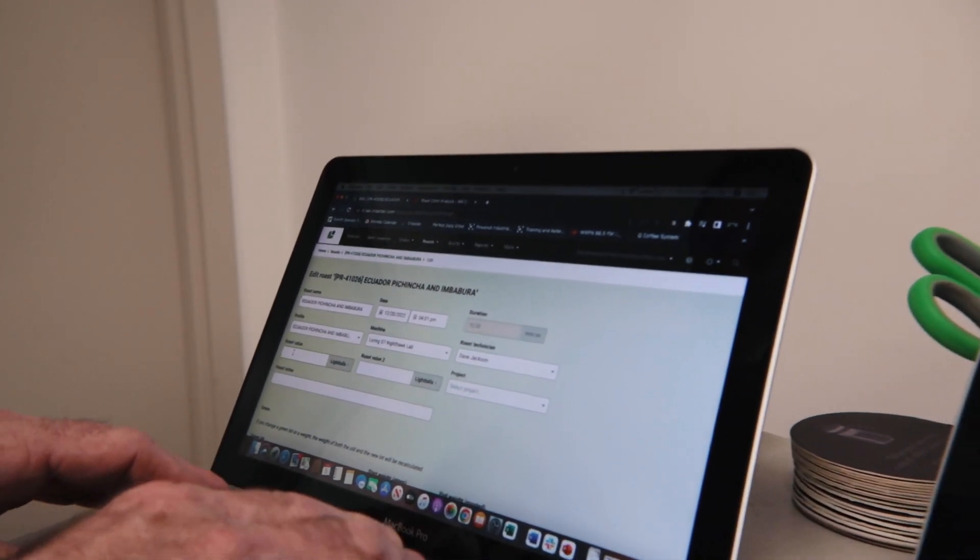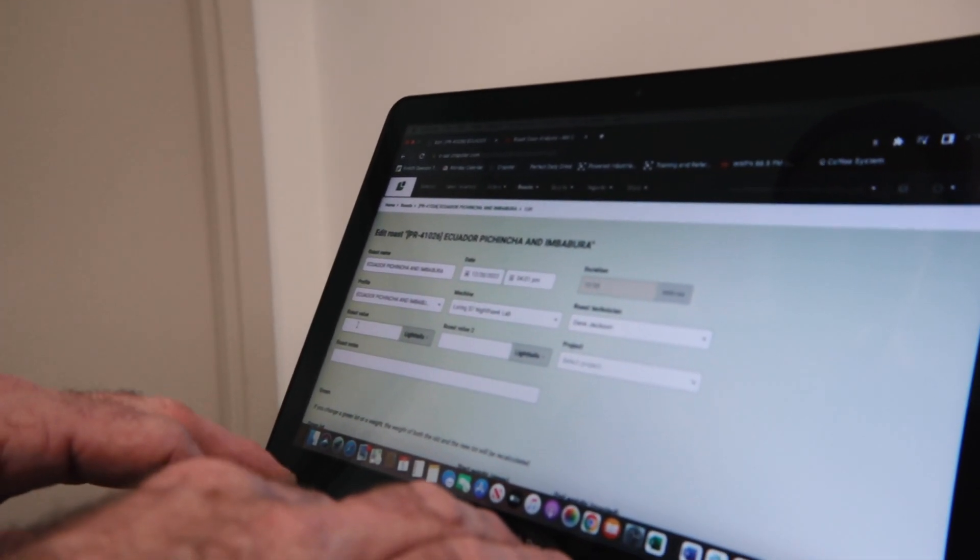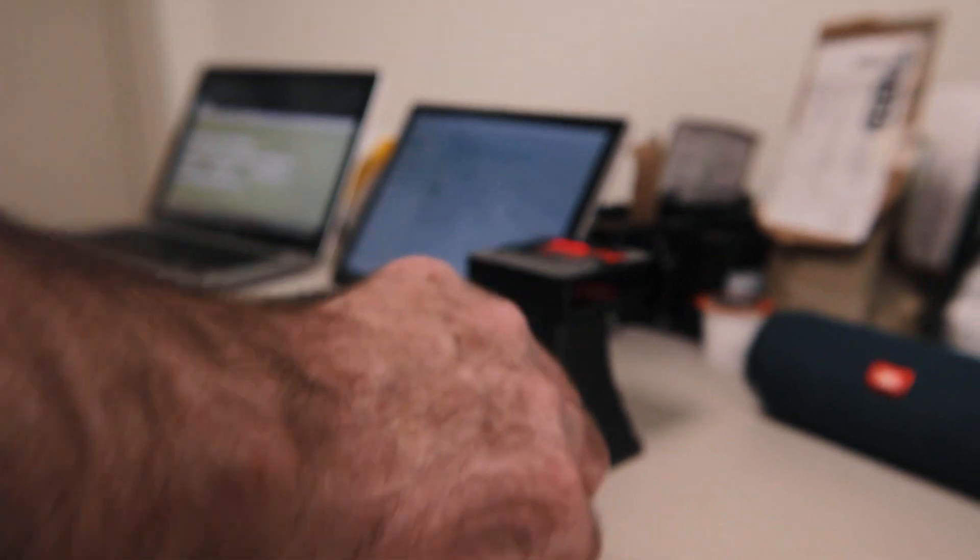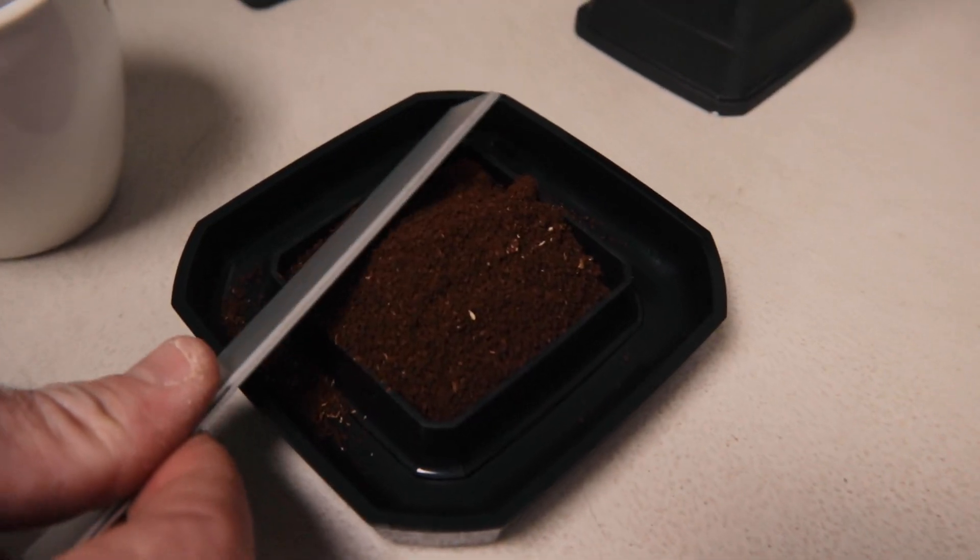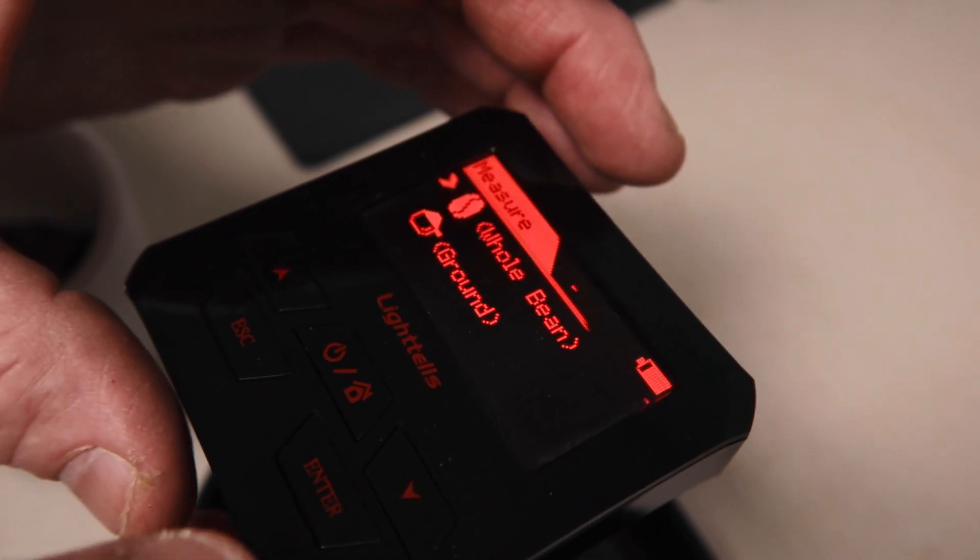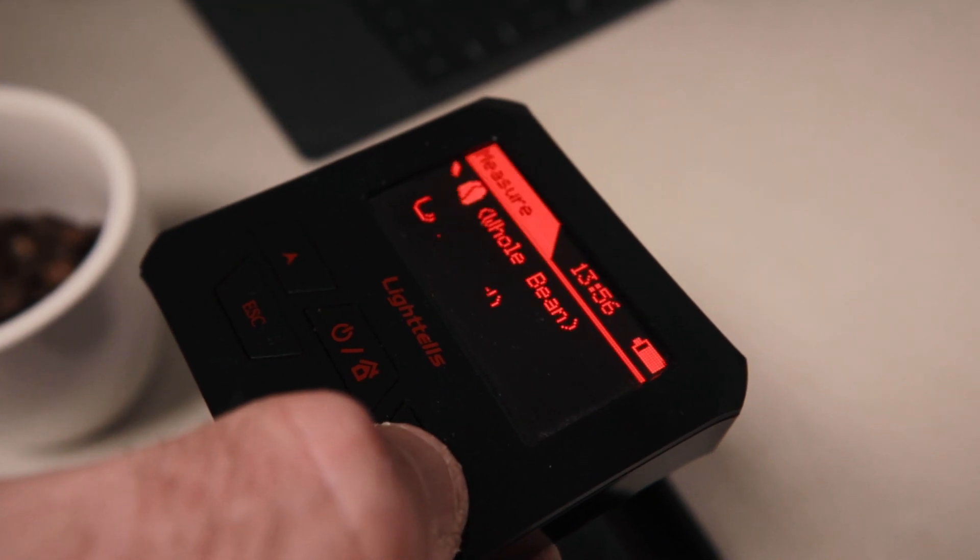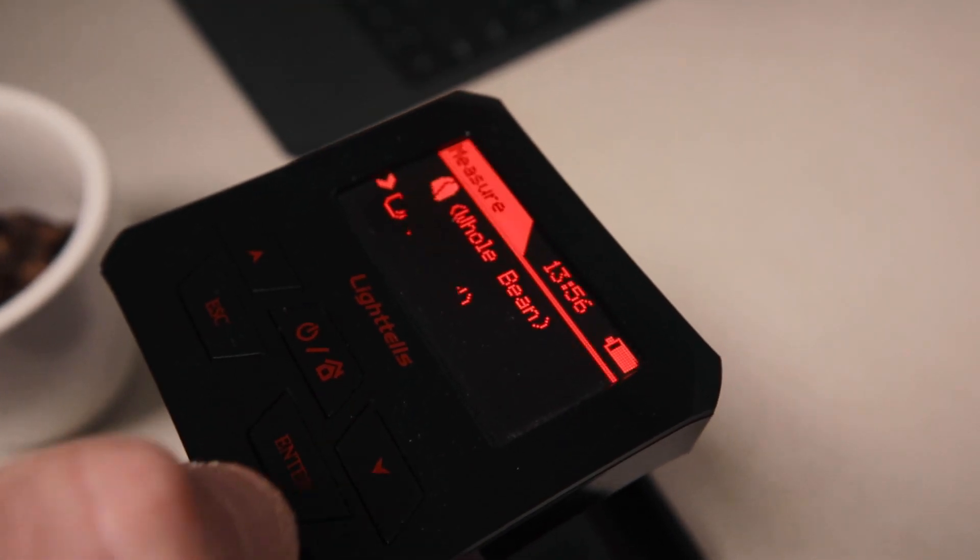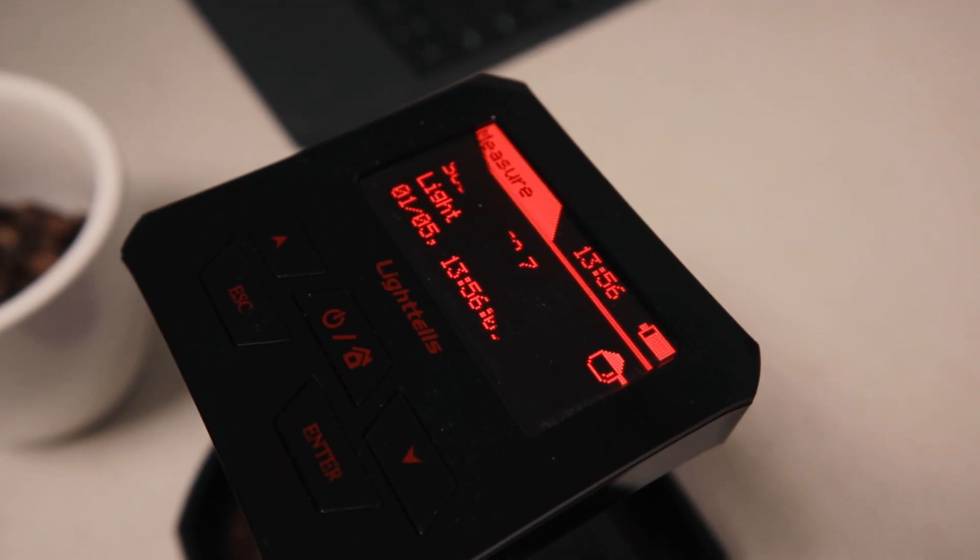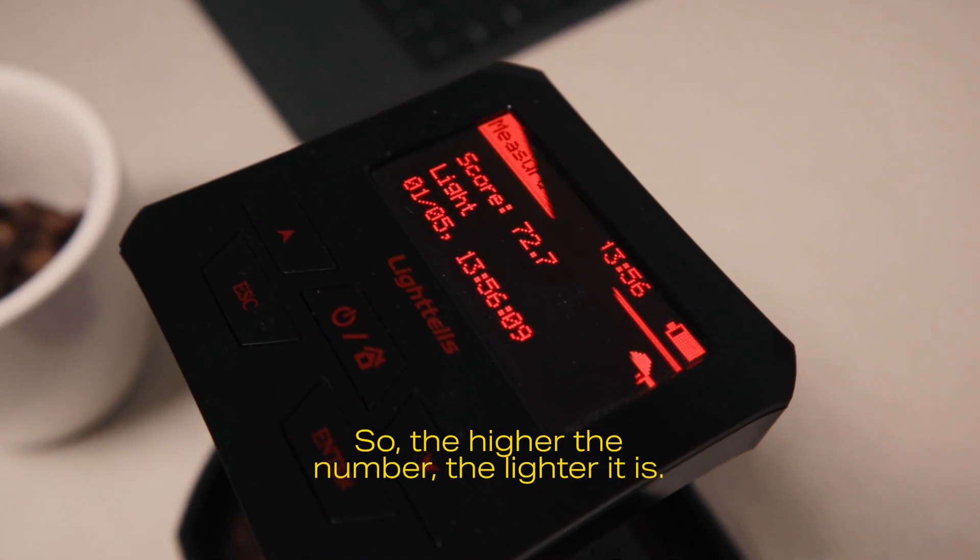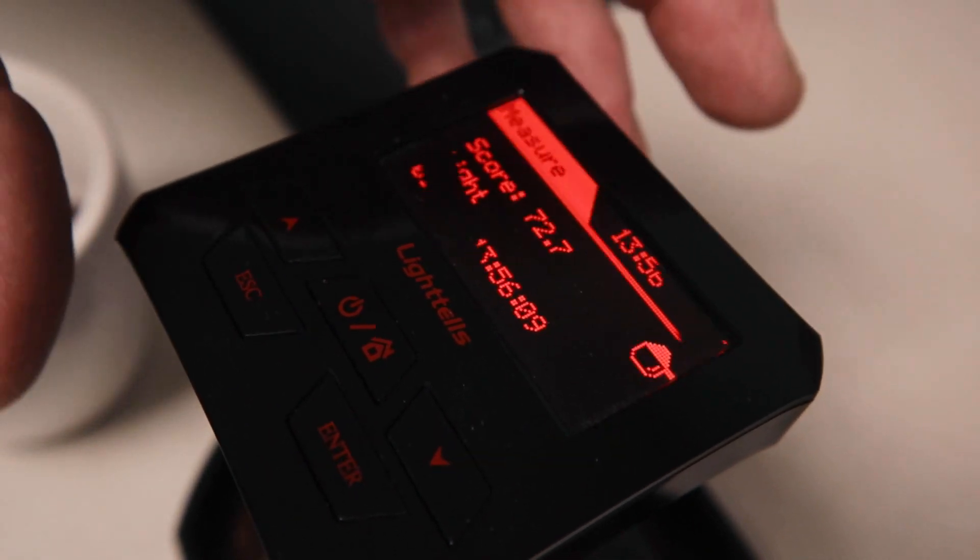I'm going to put my roast value 63 in roast value one. Now normally your ground color will be a lot lighter. Ground. So we got a 72.7. The higher the number, the lighter it is. That is correct.